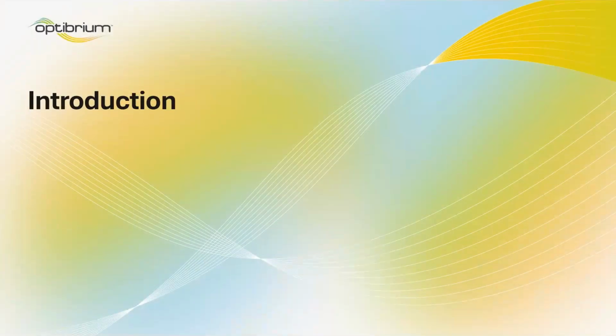Now, by way of introduction, I'm going to be talking about StarDrop. And for those of you who don't know me, I've been part of the StarDrop project since its very beginning. This goes back before Optibrium even existed. Indeed, it goes back to before StarDrop was even called StarDrop. Right now, I'm going to be focusing on where we've got to today. But before I do, I'd like to give a little bit of context based on some of that history.